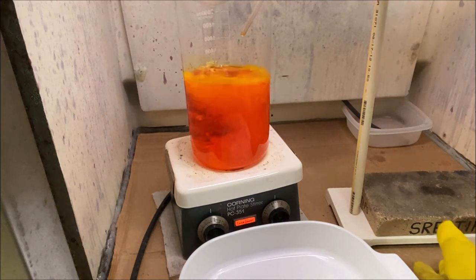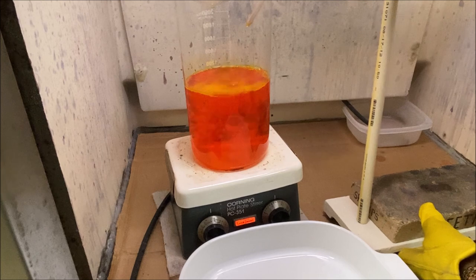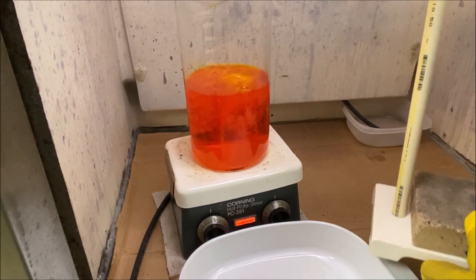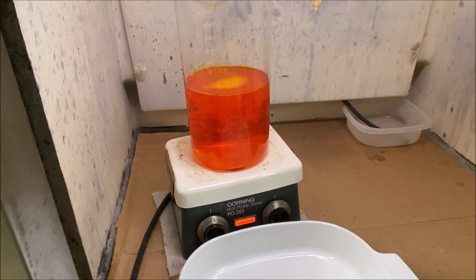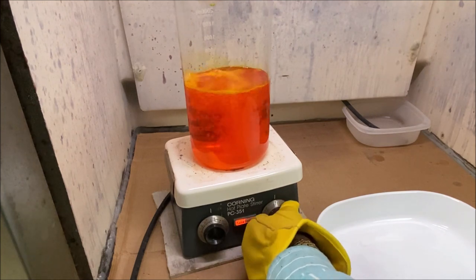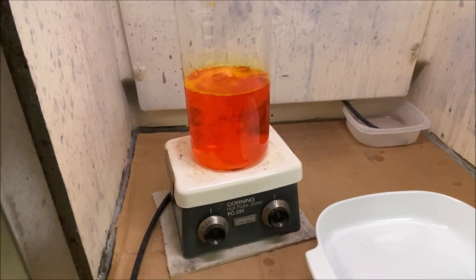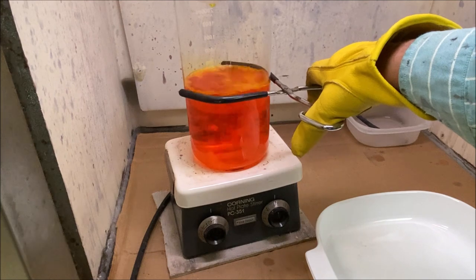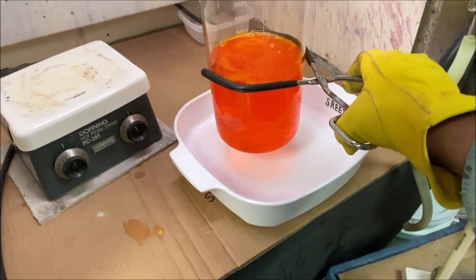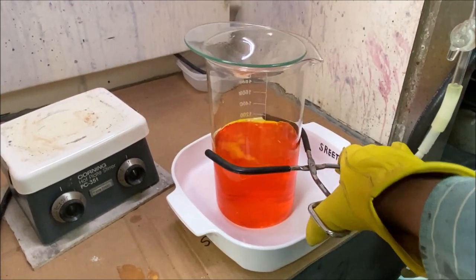What we're gonna do is remove our delivery apparatus here from the fume hood. Now we're gonna shut the heat off. I'm gonna take this down off of the hot plate here. And we're gonna set it down here and let it cool off, and we're gonna go from here.